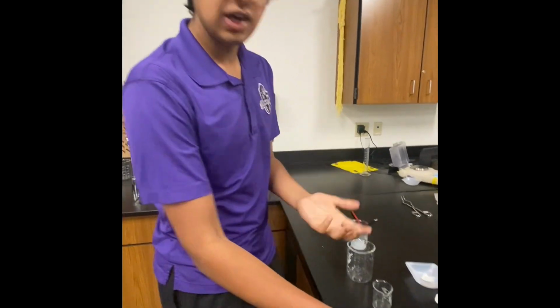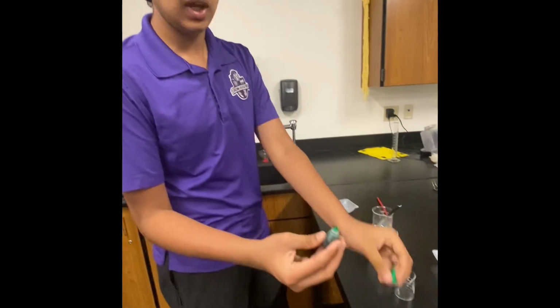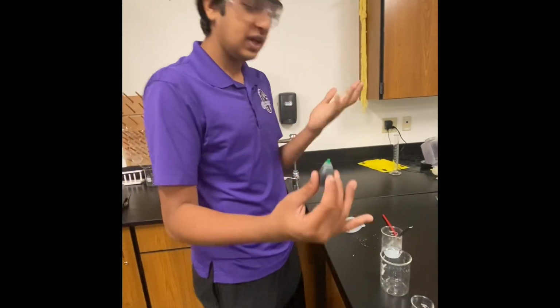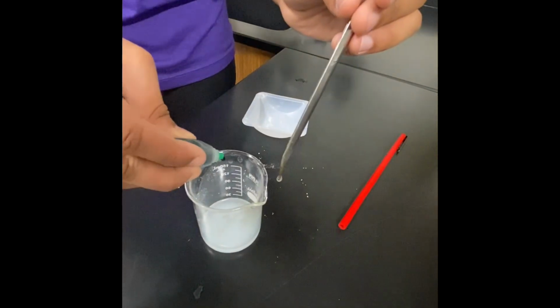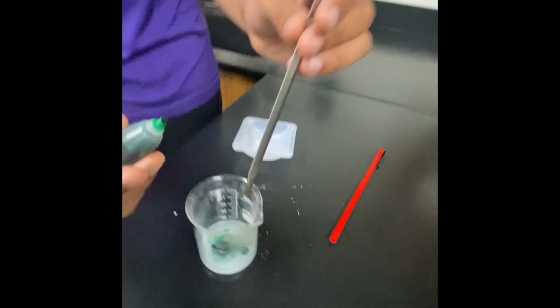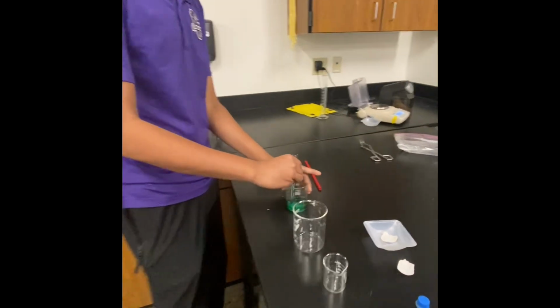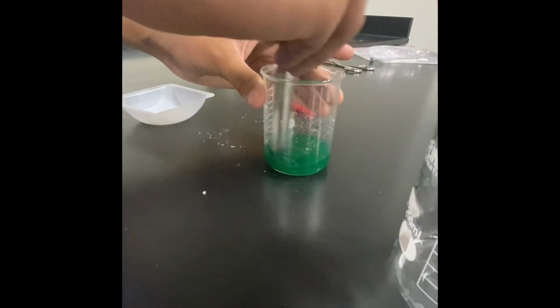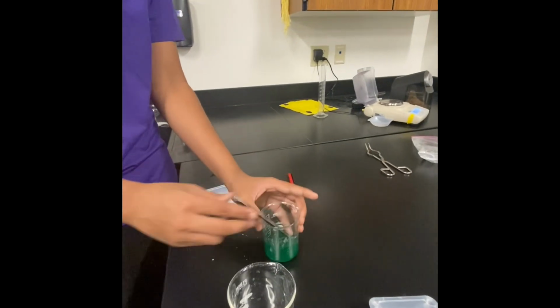You can choose any color you want, darker the better, so it glows a little better. We'll use green, and you don't want to put too much, around 3 to 5 drops right here. That's perfect. We want to let it set, maybe mix it a little bit. That should be good. You can see that's a nice green color, so perfect.